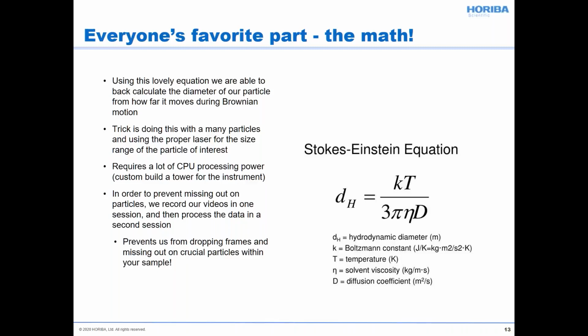So as we use a color camera, and so you have a color video, which has a red channel, green channel, blue channel, one for each laser. And so the computer decides which set of lasers to use, or which laser color to use for each particle in a measurement. So we run it simultaneously, we have all this data, and then we do the processing afterwards.